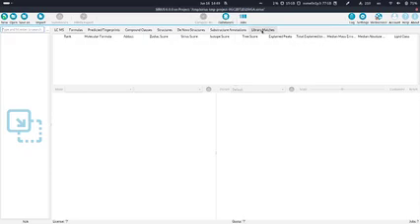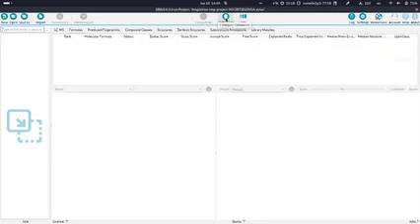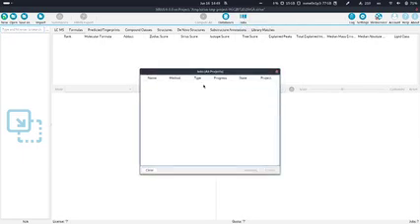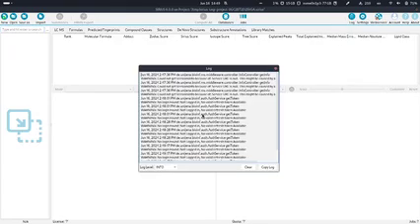You will also see, in the middle, I will show this very soon, you have a button to compute stuff, a databases button, and a button to show running jobs. If we click on it now, there will not be anything there. As I said already, you have a log, which can show you something. For example, if you try to load in some data and you see that nothing is happening, or maybe not what you expect is happening, it's always a good idea to look into this log window to see if there was maybe an error. This is also what you see in the terminal if you have this open.